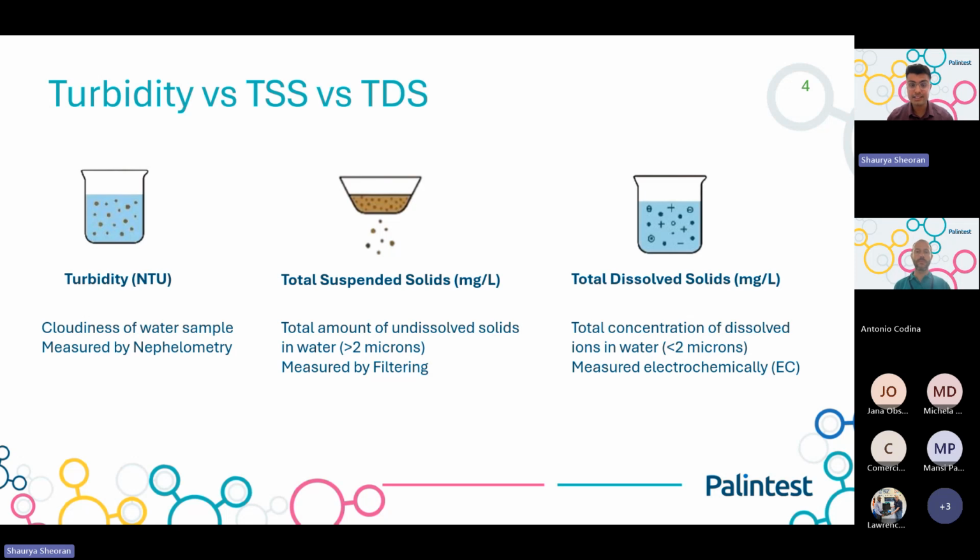So I wanted to highlight the difference here because there are many devices which correlate, but we want to create the awareness that you are measuring three different parameters and you require three different techniques to measure these.